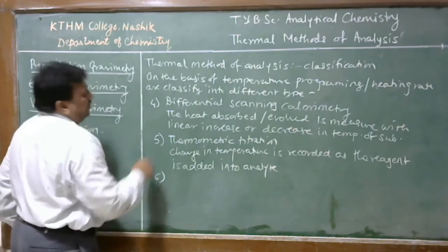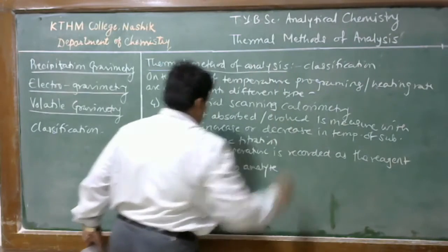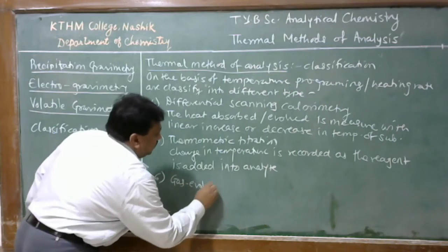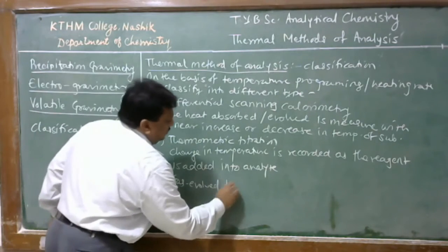The last type of thermal methods of analysis is called the gas evolved technique.